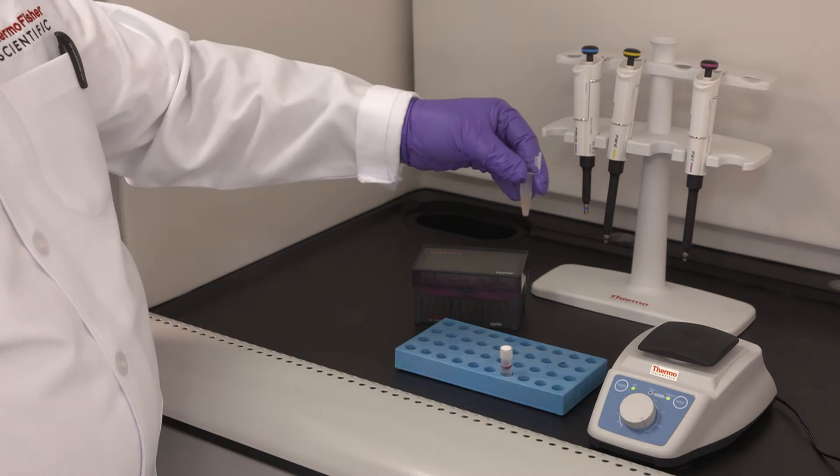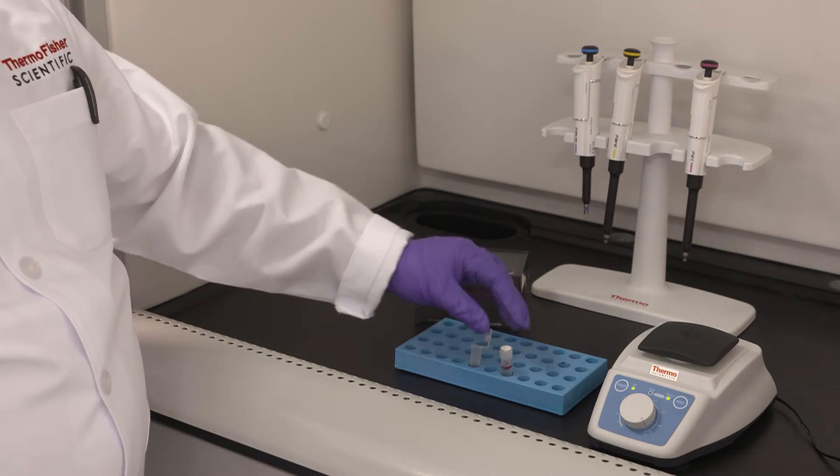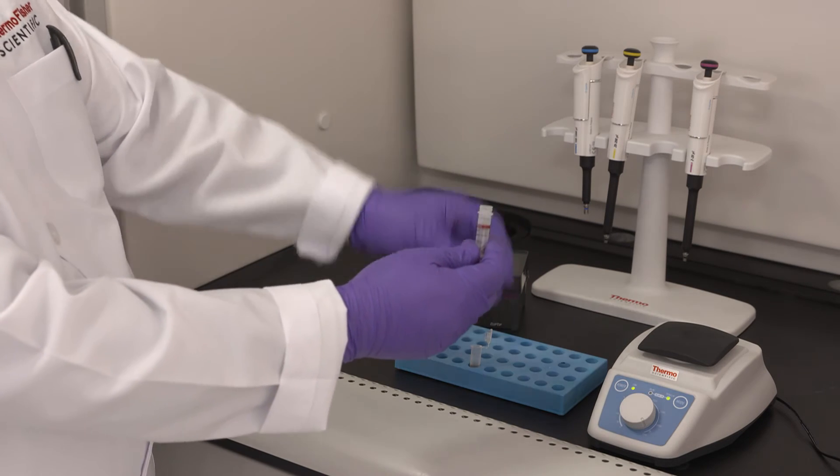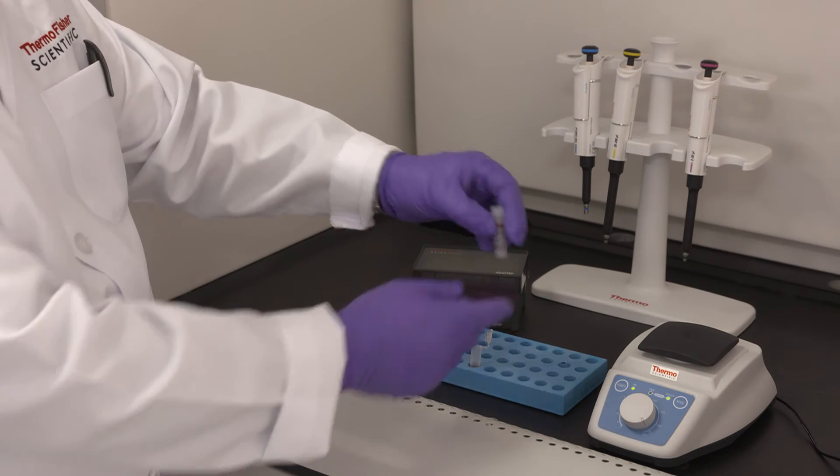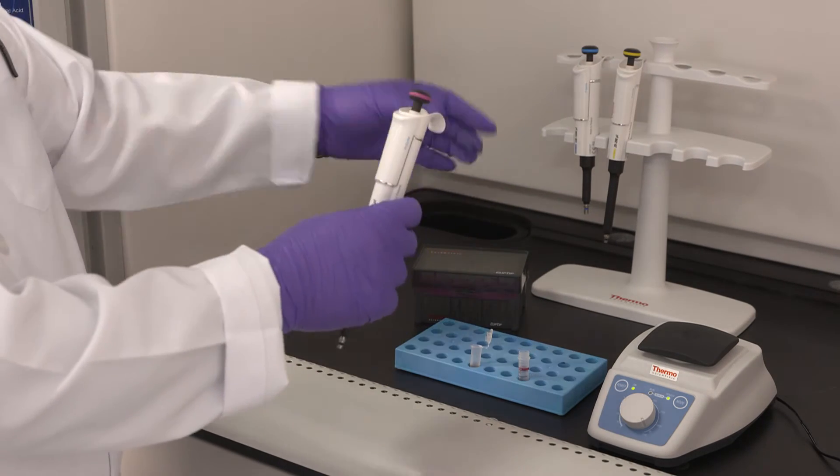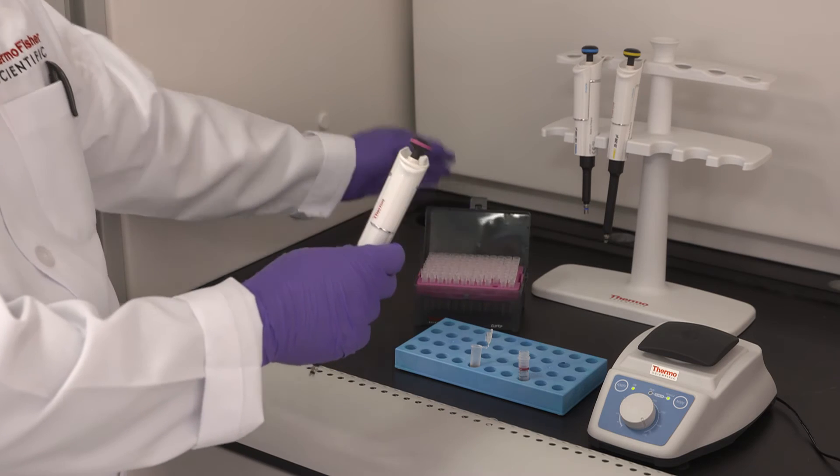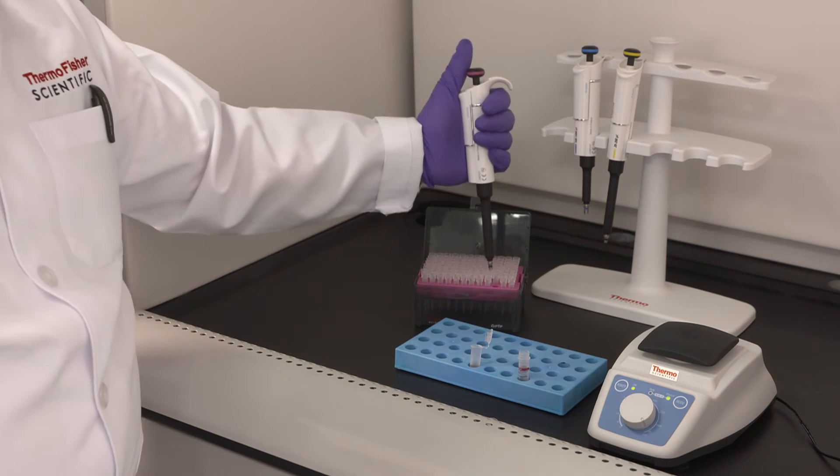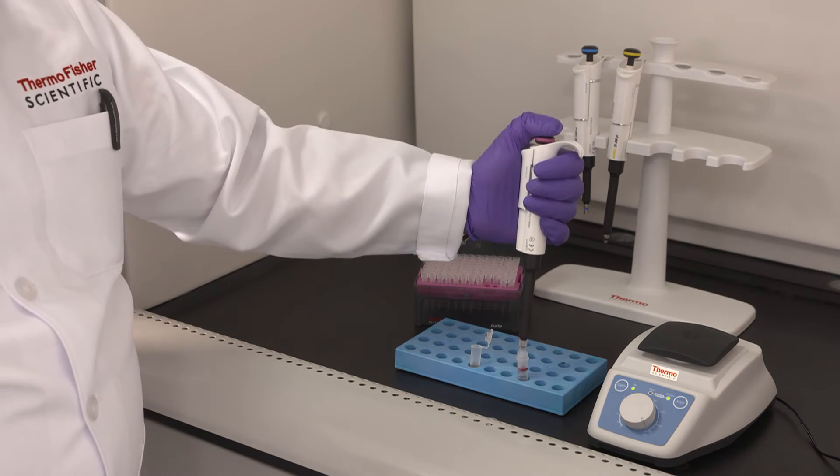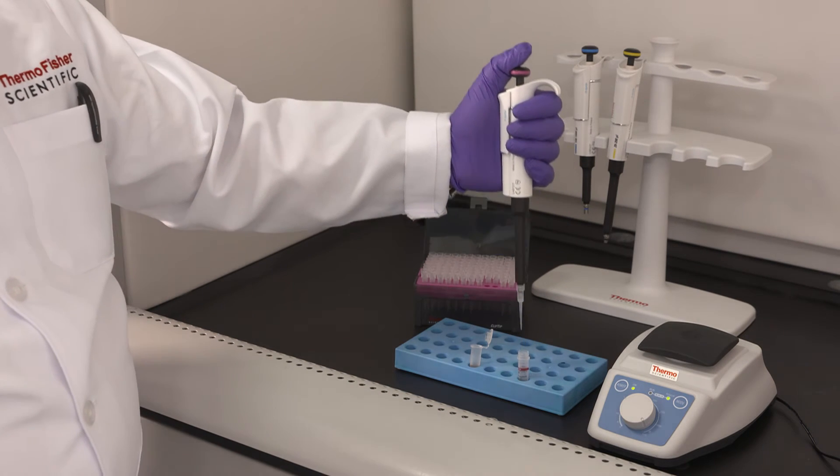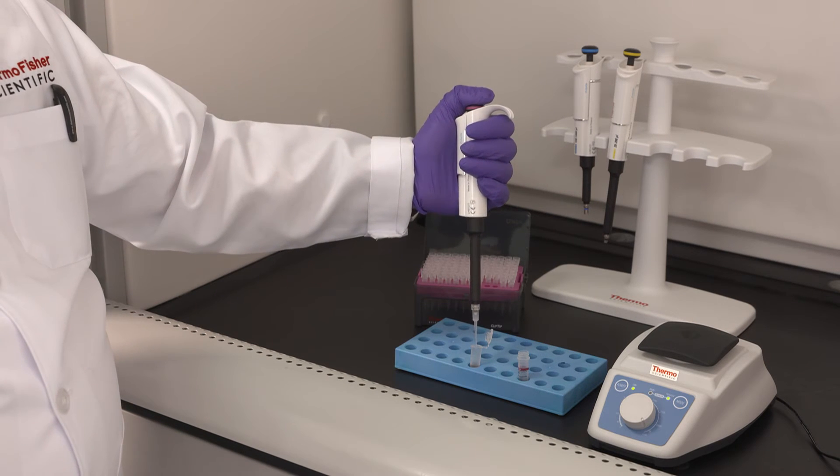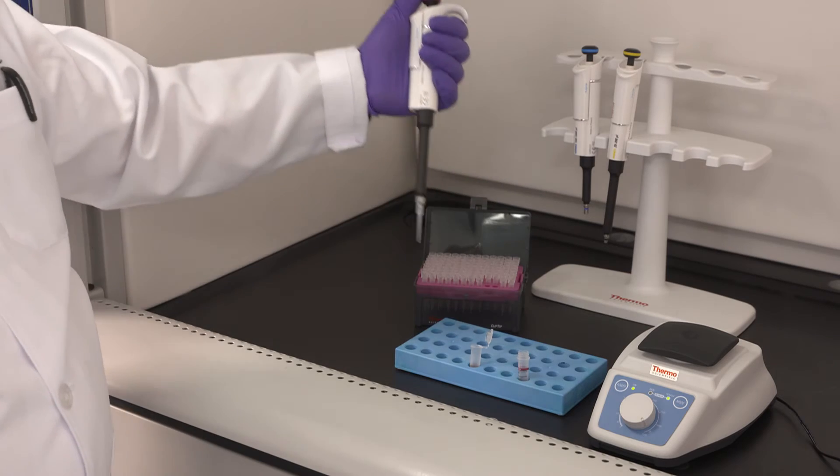We will add trypsin. We will add 2 micrograms of trypsin. We will add 10 microliters of a solution that has been already prepared where we add 20 micrograms of trypsin dissolved in 100 microliters of 1 millimolar HCl solution. So we are adding 10 microliters to the sample.